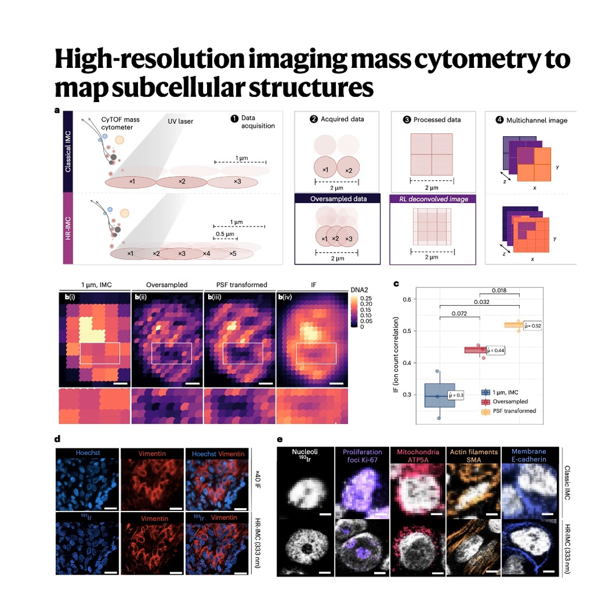And that leads us to our final provocative thought for you, the listener. Now that HR-IMC can map the exact location of DNA damage and repair proteins inside a cancer cell and see their colocalization with open transcription sites, what specific, complex drug resistance mechanism, perhaps involving a cell sensing damage and rapidly shuttling an essential repair enzyme out of the nucleus before it can be targeted by a drug, could this level of detail help us uncover next? Think about the movements you can now track that were entirely invisible before.